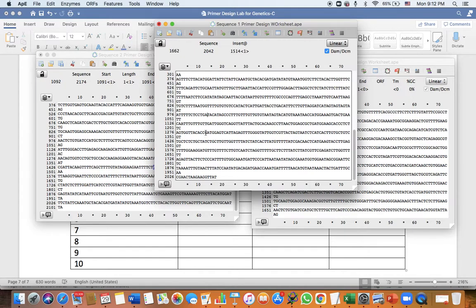So that's another thing. You could identify the sequence that is inserted or the part that is deleted and search for these parts in NCBI BLAST and tell me more about these things, or more about the organism or the genes themselves.